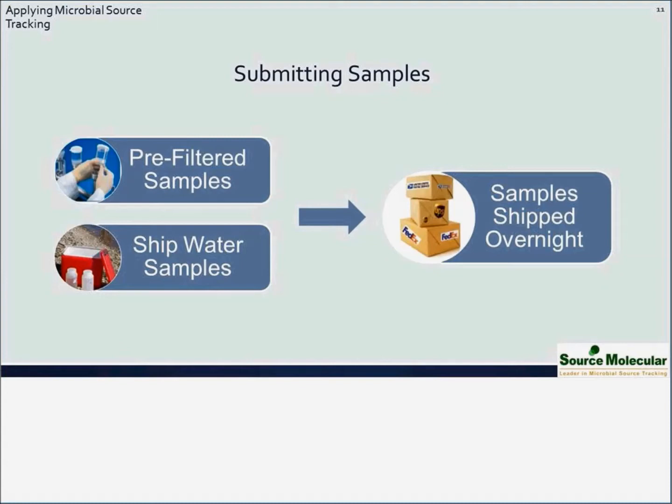And so the water samples can be simply collected like you would normally do, put in a cooler like you normally would do, and then shipped to our laboratory overnight. And because these are genetic methods, the hold time is not as restrictive as the enumeration general bacteria monitoring methods. And so we receive a good number of samples as water.